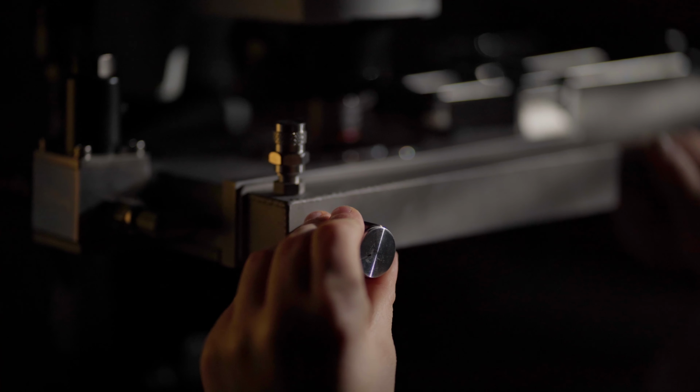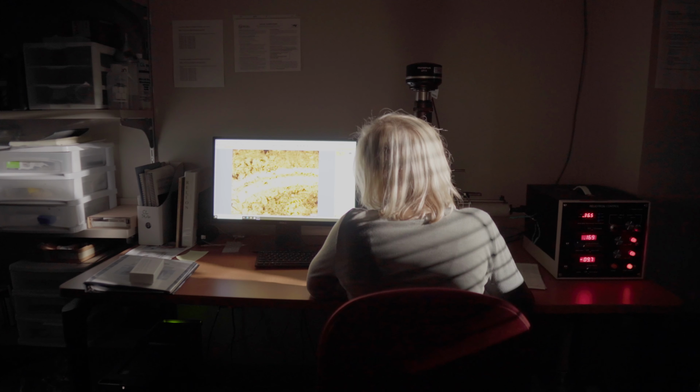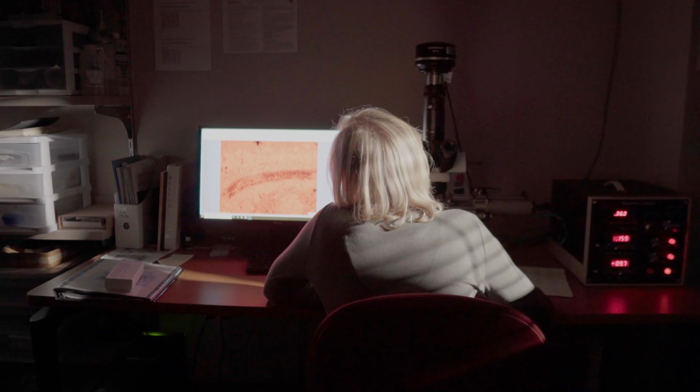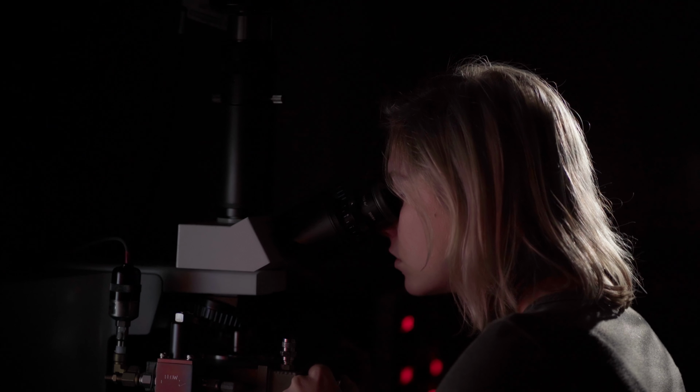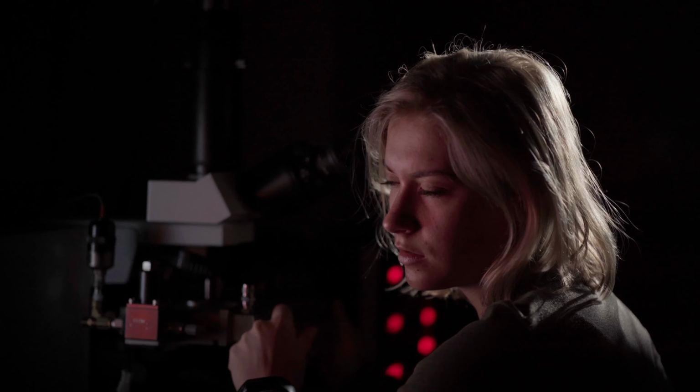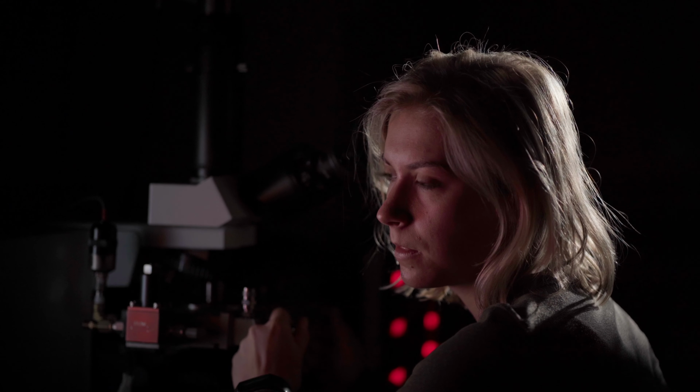You hit a rock with energized air and it glows in ways that show how the crystals have grown, or more importantly, if they've been damaged and then healed. If the fluids have damaged the rock, usually they alter the chemical signatures, and then we know we probably can't use that data when we look for patterns in the chemistry.